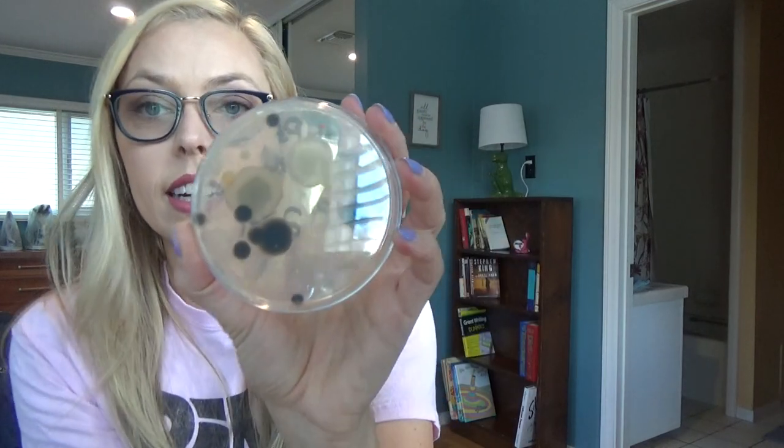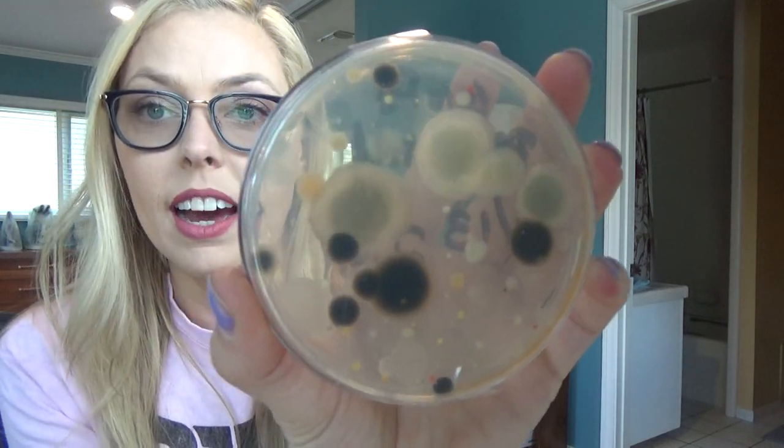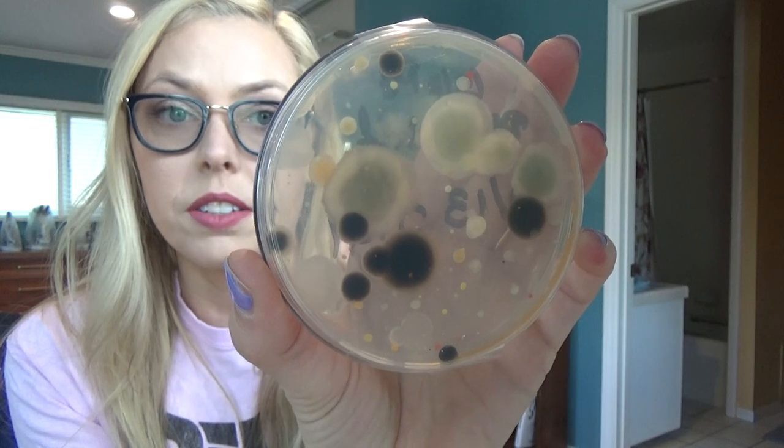It is a little bit hard to see, but you can see on this side what all was on the PE towel. Lots of dark spots, lots of orange spots. I think if I did this experiment again, I probably wouldn't have written on the top — I'd write on the bottom, but always trying to improve. There's quite a few little spots on here: a long line of orange spots, 9 dark spots, and then a bunch of smaller white spots.